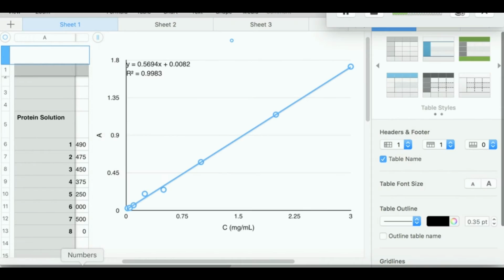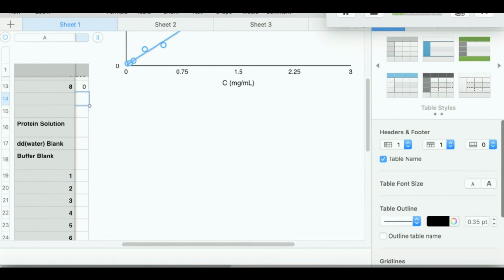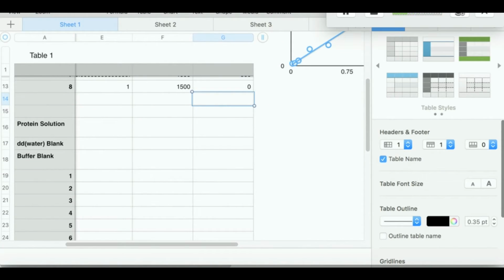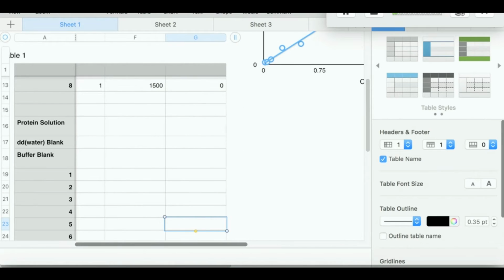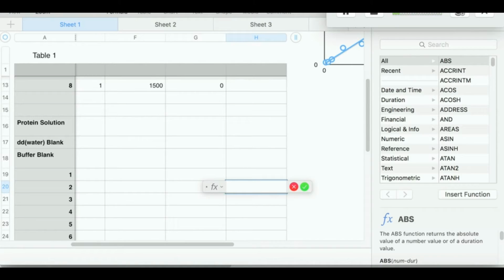So let's go ahead and do that. I can actually do that in Excel, and I'll show you how. It's pretty easy, and you do basically the same thing in both Excel and Numbers. Just pick any one of these little slots and write an equal sign. In Excel, as far as I know, the version I used to use, it doesn't bring up this little function thing, but in Numbers it now does.